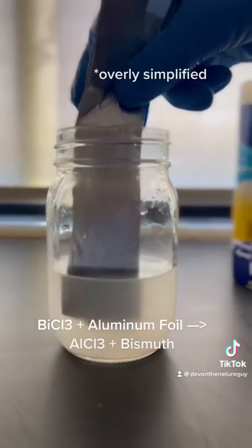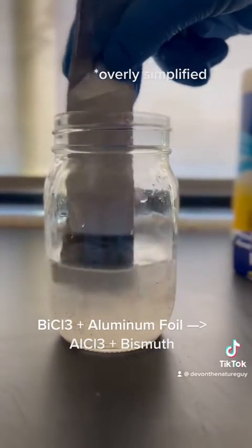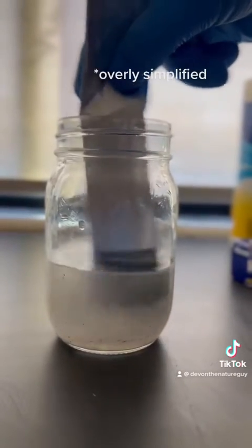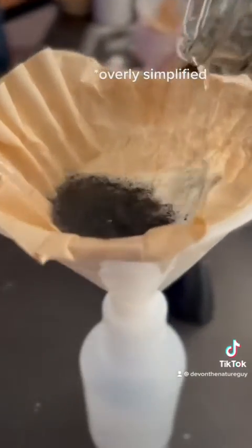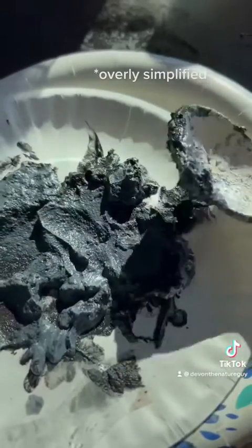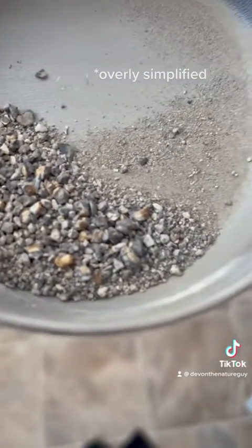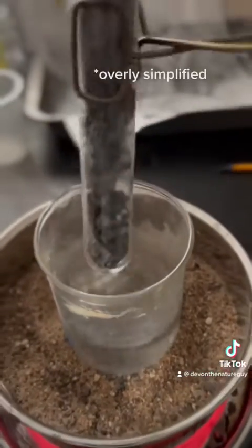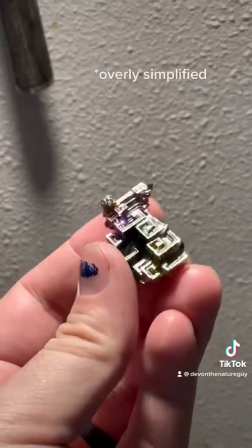You can actually watch it start to flake off the foil. Filter it out — you might have to do it a few times — and eventually you'll end up with a paste that you need to dry out to look like this. After carefully melting it down and allowing it to cool, you'll end up with this crystal.